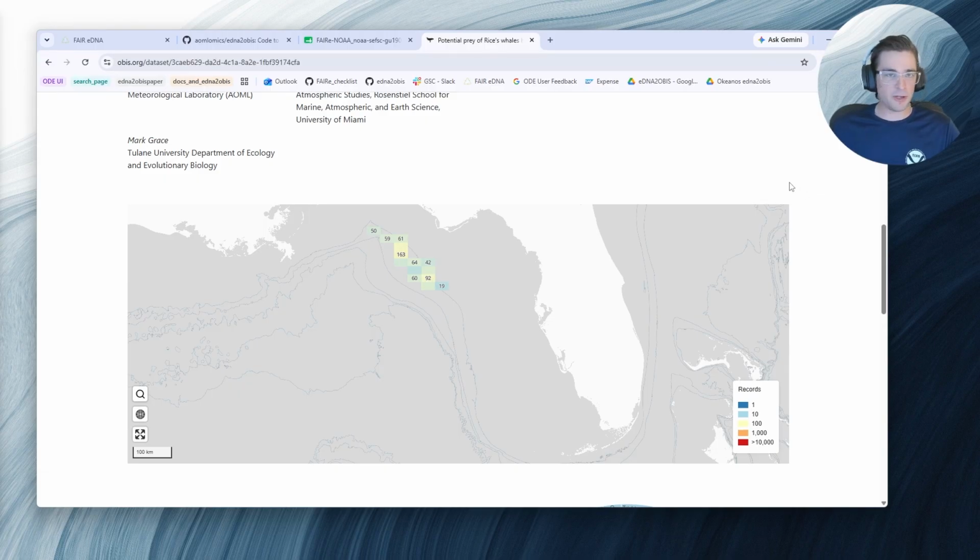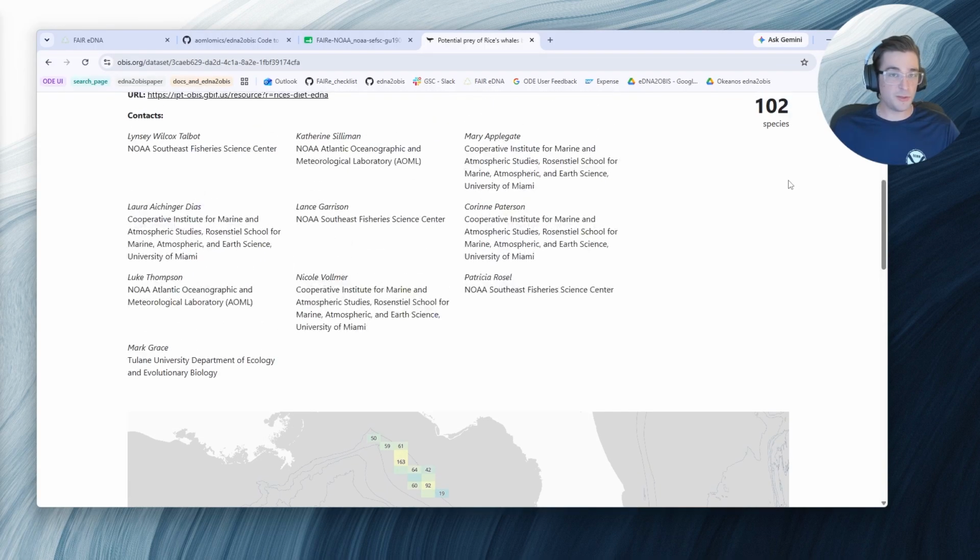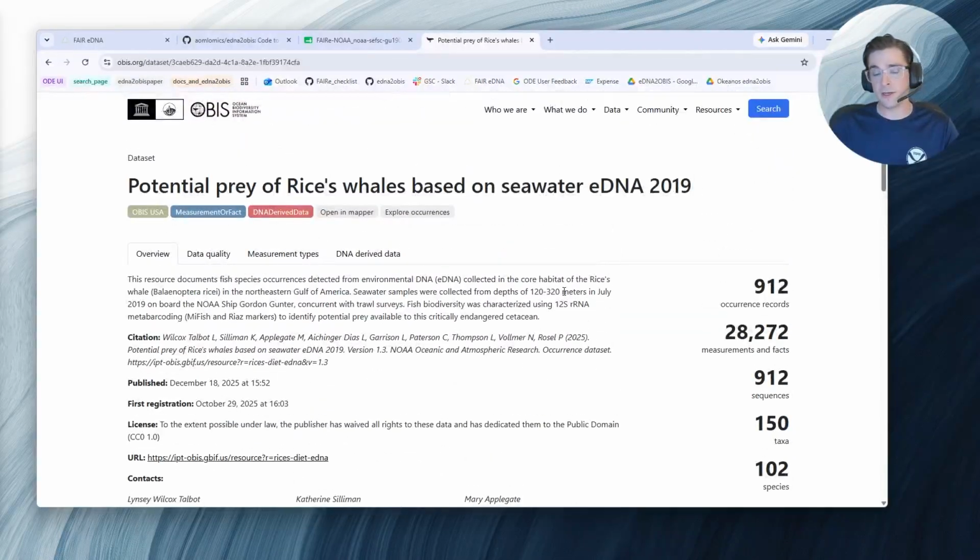And so today we're going to walk through what the tool does. We're going to take a look at the input files. We're going to watch it run. We're going to customize our run, and then we're going to review the outputs and then do a bit of a practice submission just so you can see what that looks like.